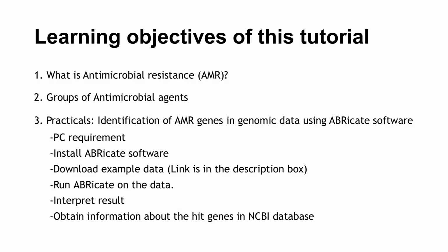In this tutorial, we are going to learn what antimicrobial resistance is. You also get to know the groups of antimicrobial agents. And in the practical session, you will learn how to identify antimicrobial resistant genes in genomic data using the ABRicate software. You also get to know the PC requirement for this tutorial.